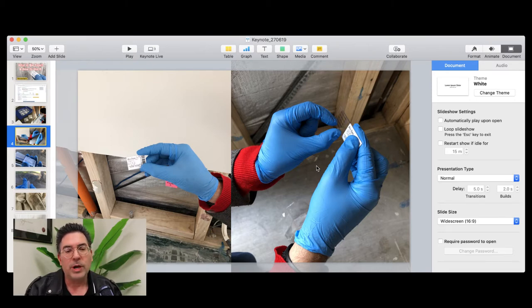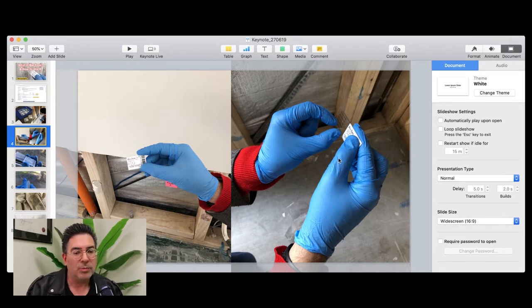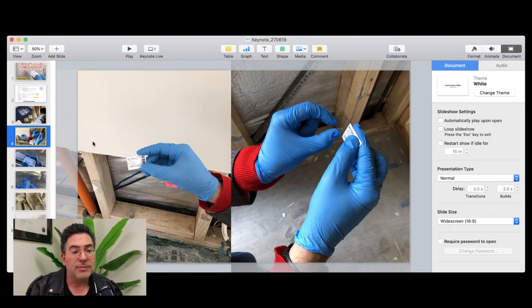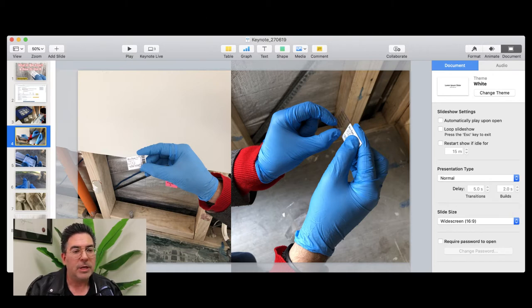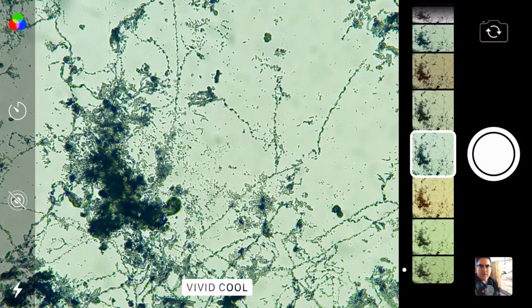If there's been a severe water ingress event, there can be serious mould problems on these framing timbers. Tape lifts are particularly useful here. I'll show you now, under the microscope, exactly what we see on some of these framing timbers.